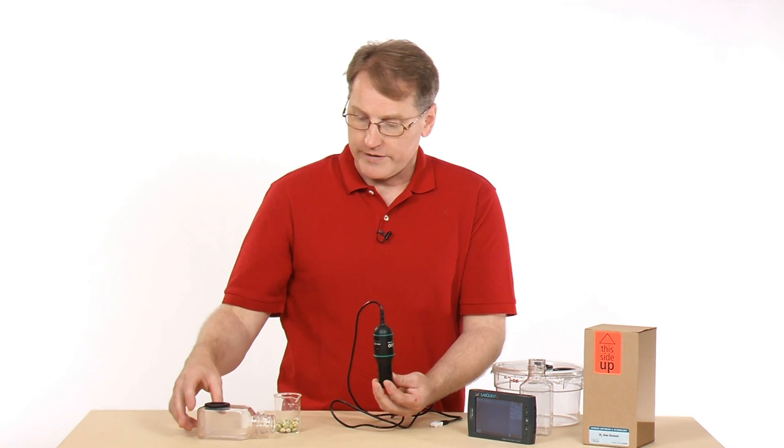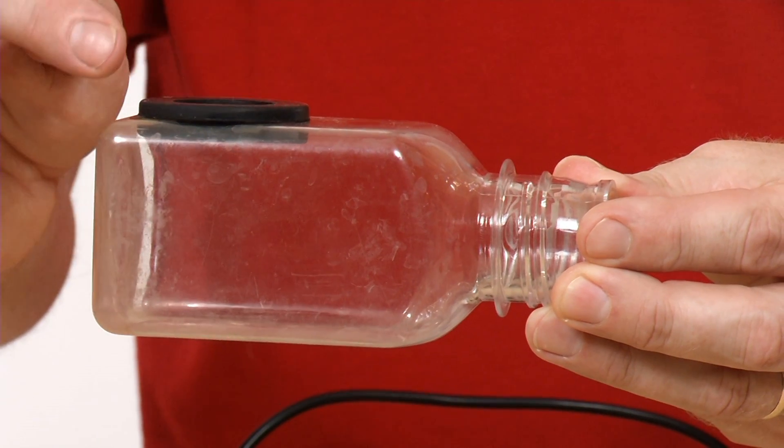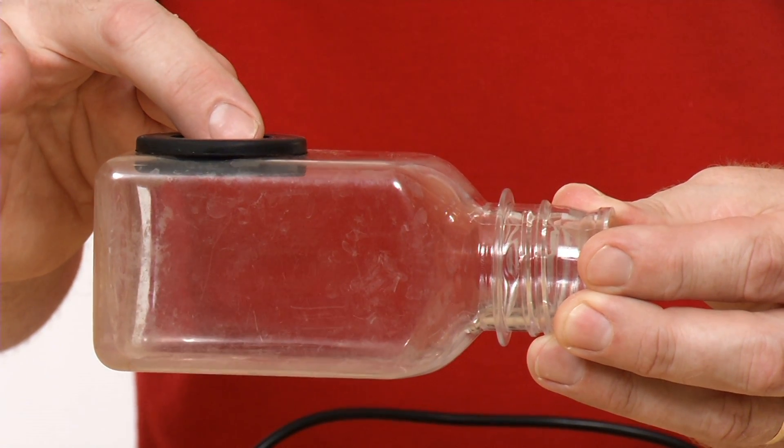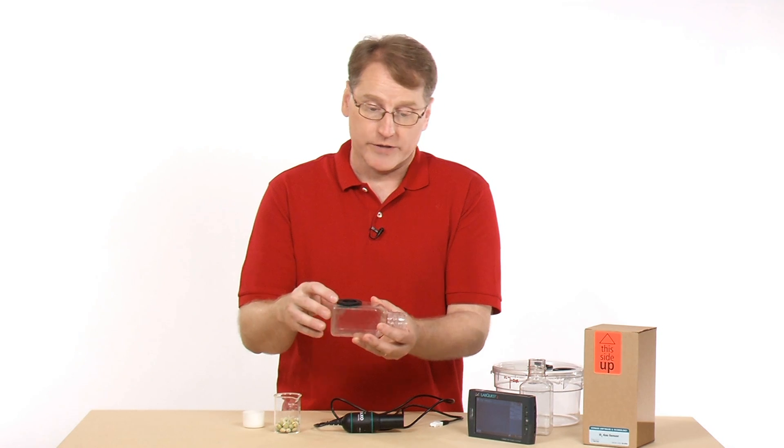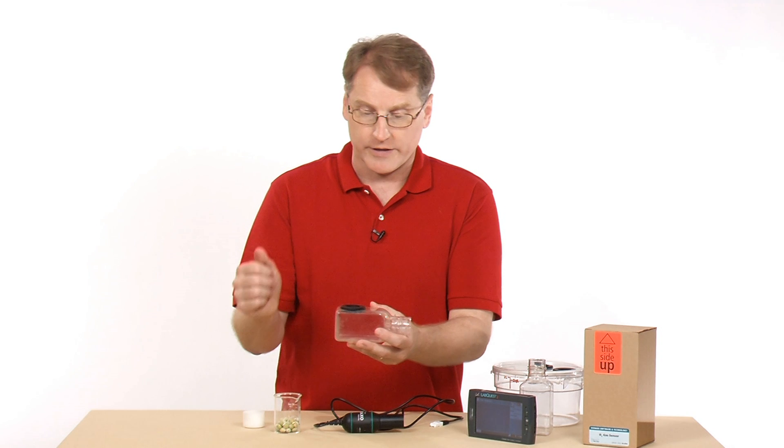Another option, though, is the BioChamber 250. And so this is the Nalgene bottle with an extra hole for a sensor to go in here. You might use this in conjunction with the CO2 sensor. So you could put the CO2 there and the oxygen in there if you wanted to.